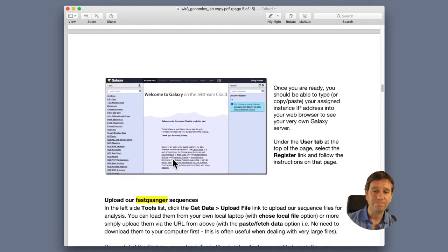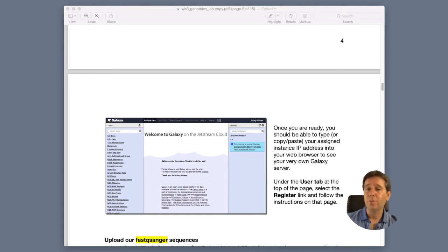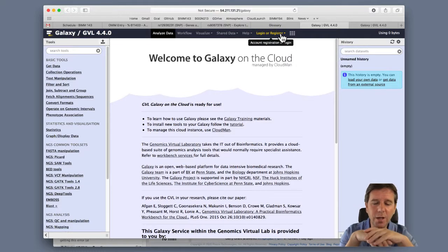So I'm going to do that too. I'll pull up the email and click on my one. Okay, here I've opened my own automatically generated email, and we're back. So this is my Galaxy server running here. You have your own URL that will be unique to you, but just in case someone else somehow finds that URL, or you've shared it with some other class, I want you to click up here to the login screen first. Actually, let's explain what we're looking at first.